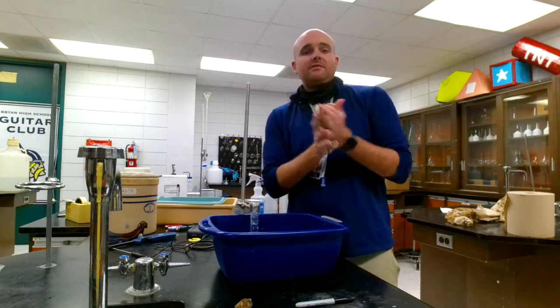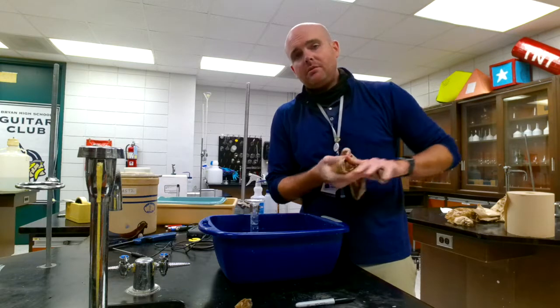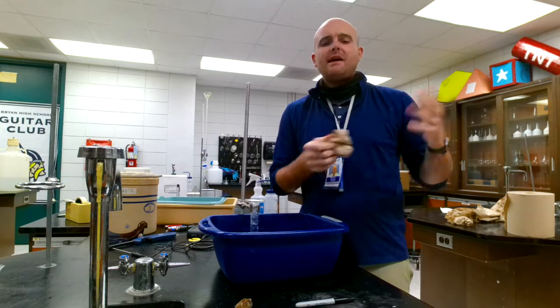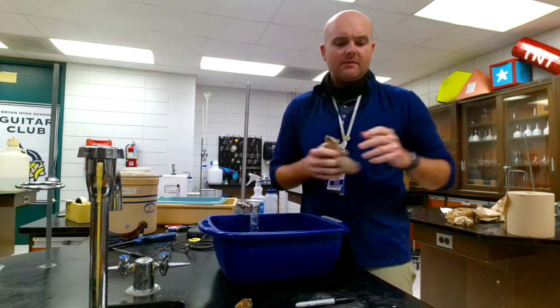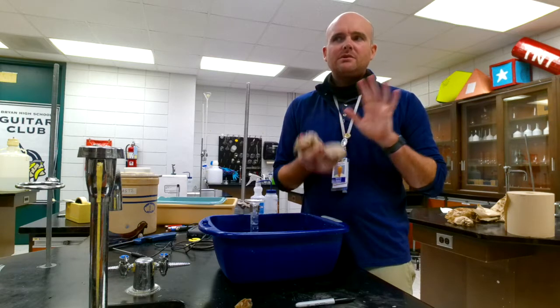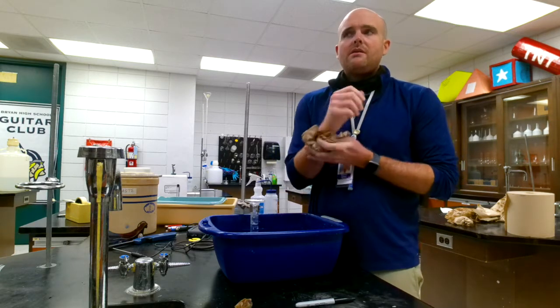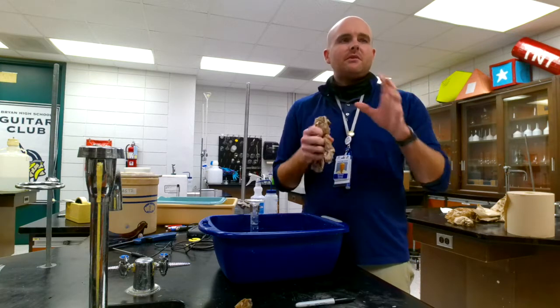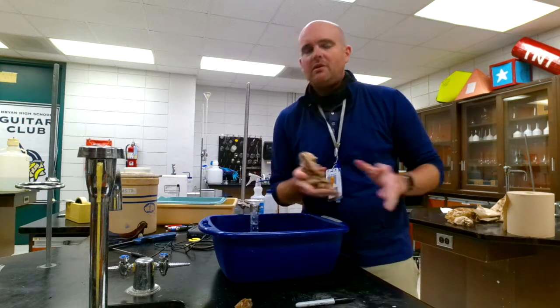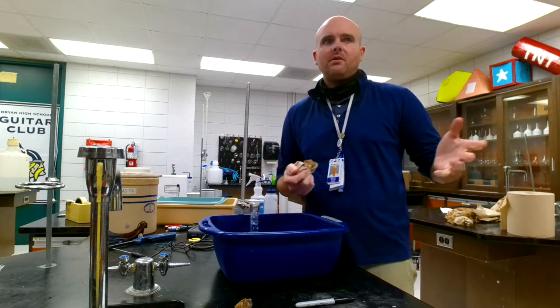Okay, while we're waiting for that lighter to dry off just a little bit, I will tell you the reason why we are not excluding your uncertainty right here. We're trying to determine the identity of a gas. So there's only set numbers of molar masses that we're looking for. You're looking for a molar mass, so it's going to be some kind of grams per mole.